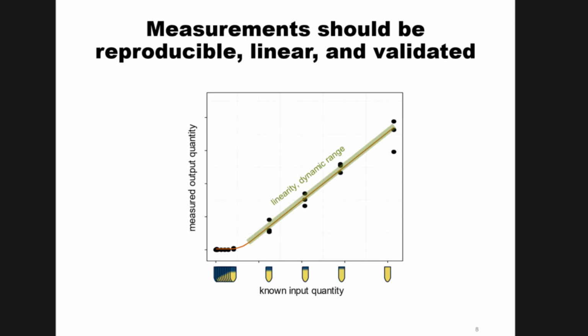A lot of times this is with some sort of synthetic isotope that is spiked in at different concentrations, from a very, very high concentration all the way down to a blank that has none of the peptide target you're interested in. And you would expect, as the concentration decreases, that your signal off your mass spectrometer should also decrease. The range where this signal is 1-to-1 is what Andy was saying is the linear range, where the slope would be 1-to-1.